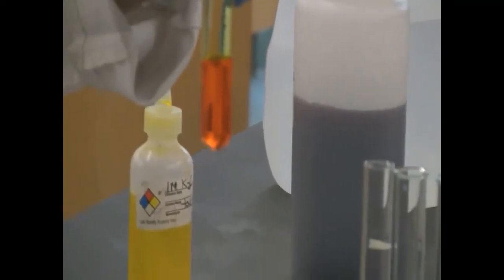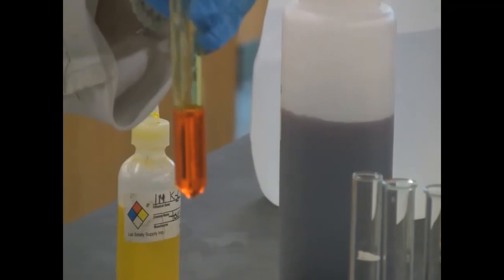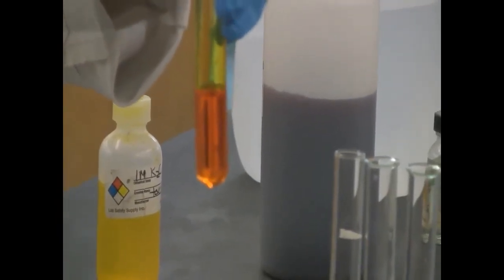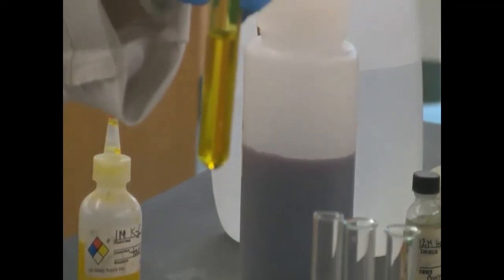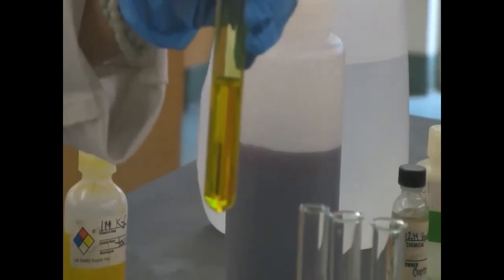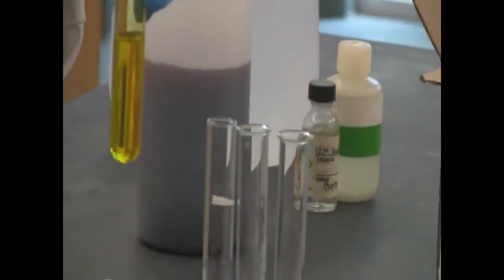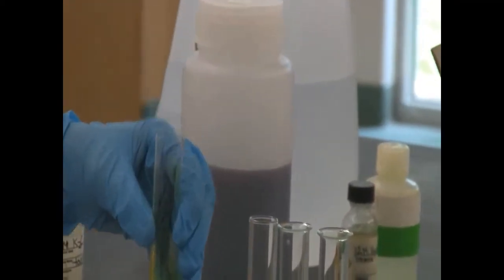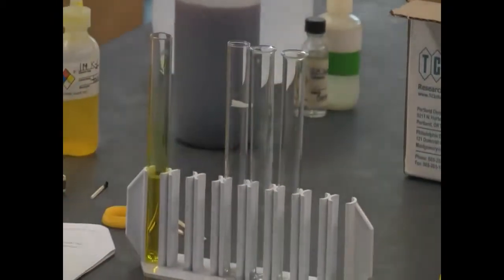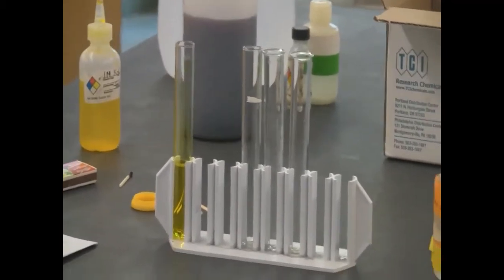Check the color, sodium hydroxide. You see the big change of the color. Which direction is this equilibrium shifted by the sodium hydroxide? Think about that based on the color change of the reaction. So that's our part E. Let's move to part F.